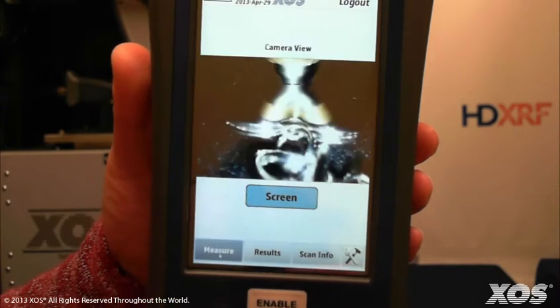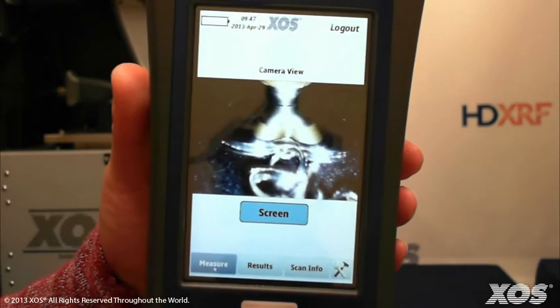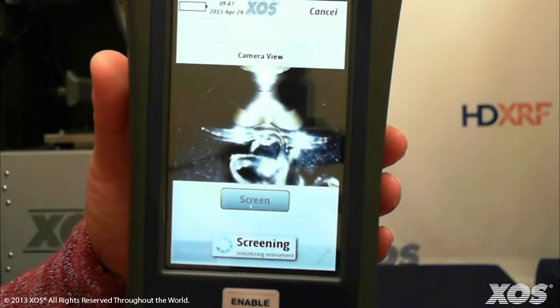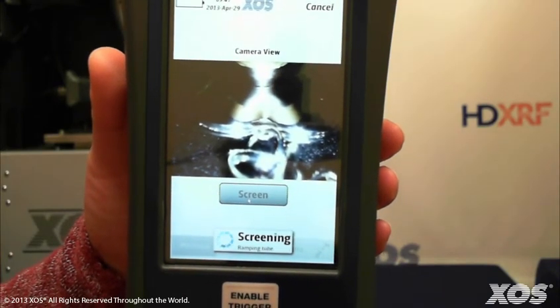Press the measure button and you'll see an image of our sample in contact with the measurement tip. Press screen and confirm that the tip is in contact with the sample, then press OK to start the screening process.